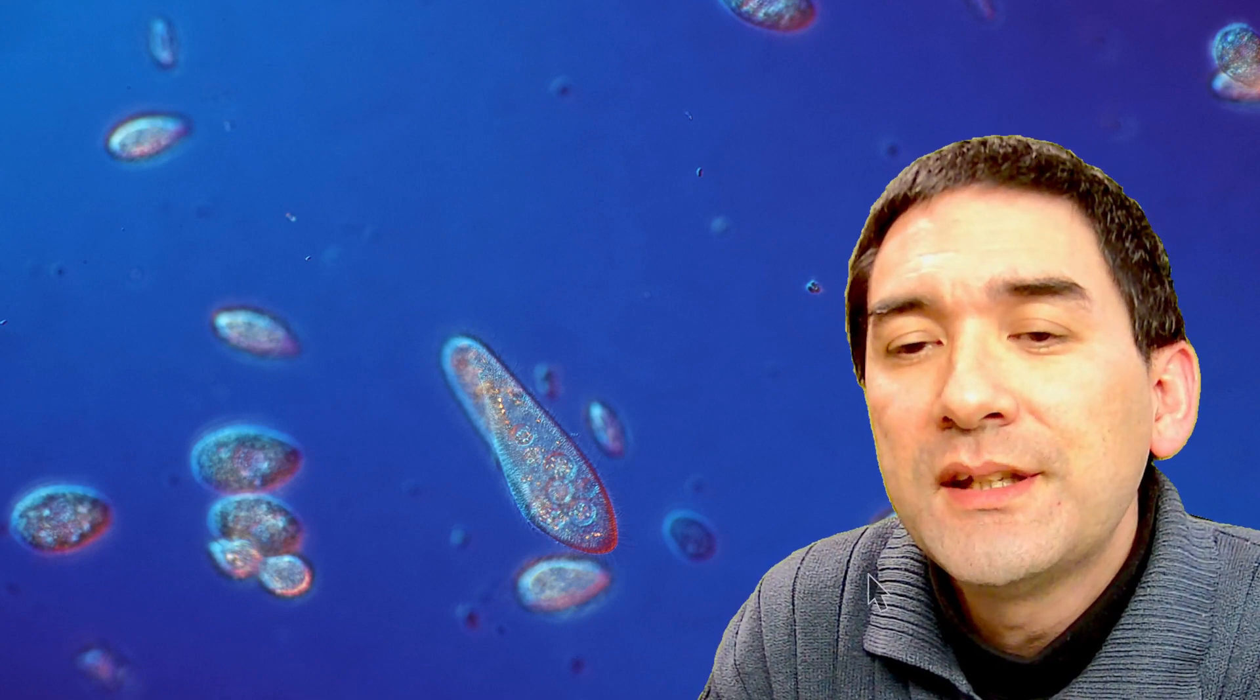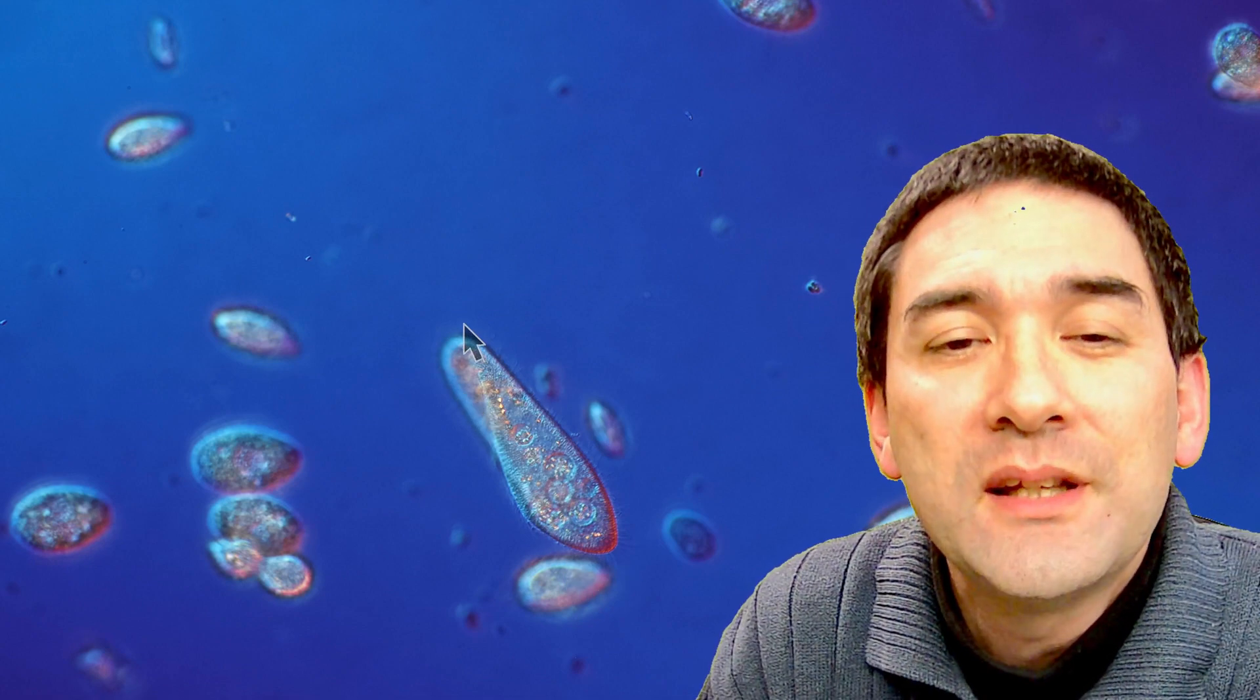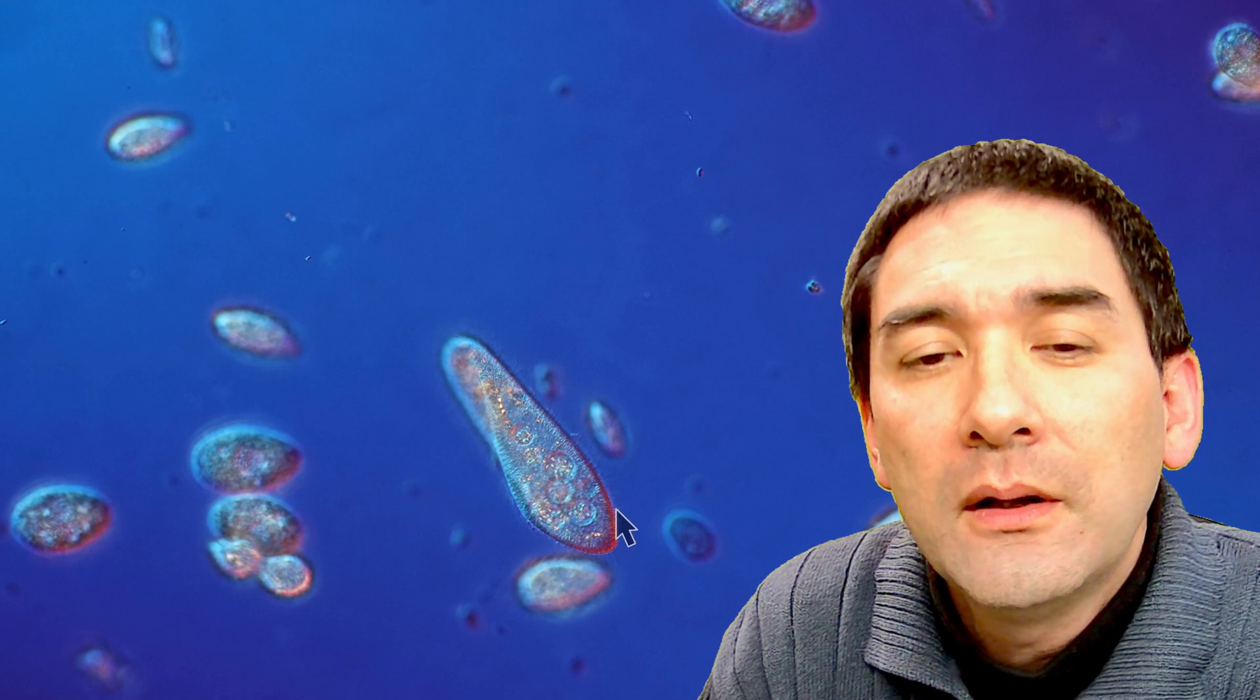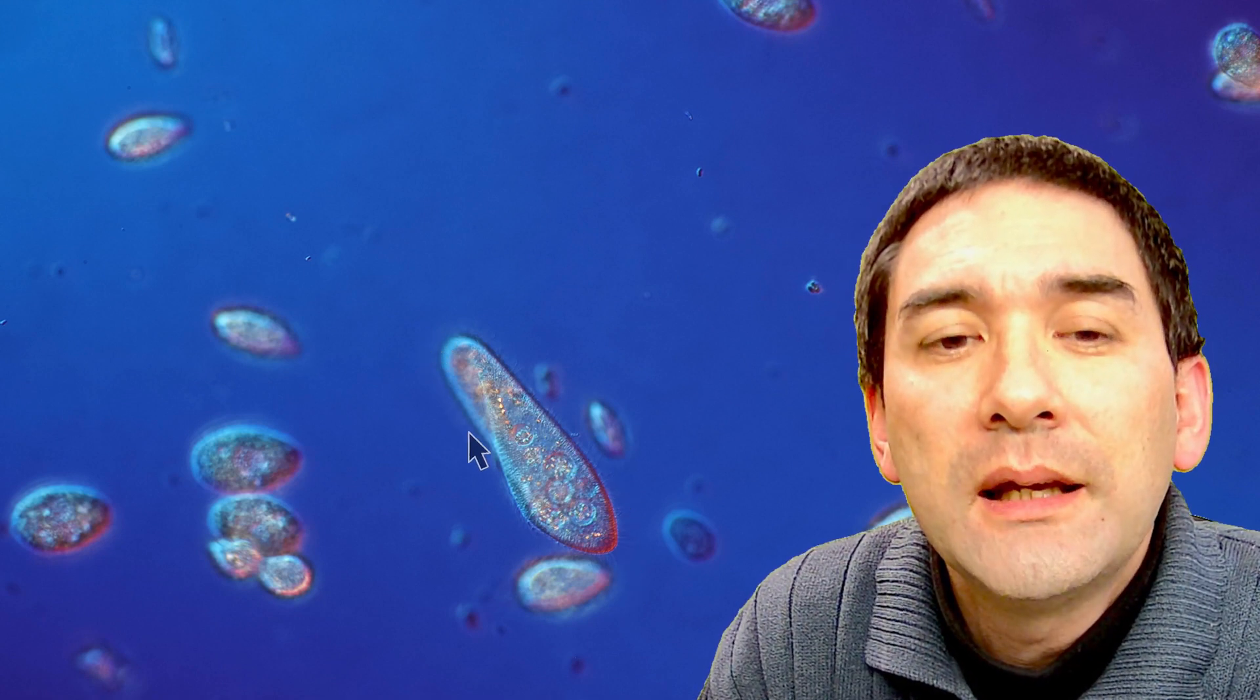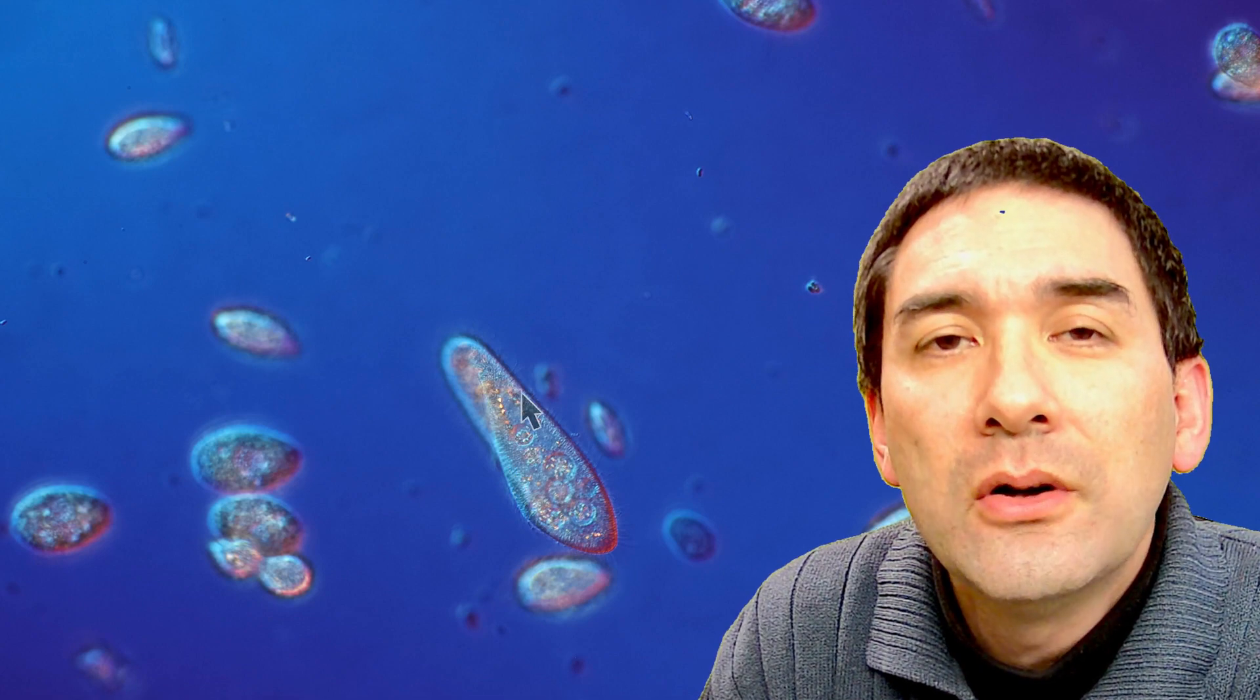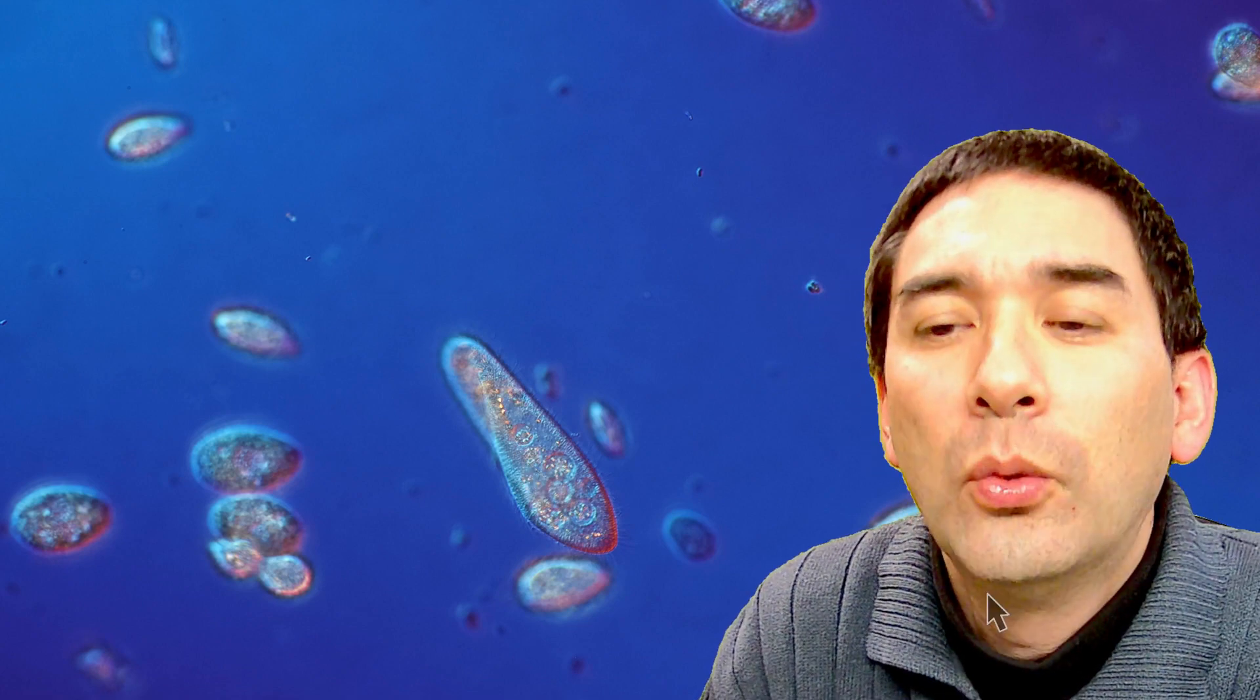What we have over here is also a single-celled protist, a very common one, many of you already know it, it's called paramecium. And if you look very carefully, it's a little difficult to see, but when the video is starting again, there are tiny little hairs on the surface, these are called cilia, and those cilia beat and they move the cell forward.